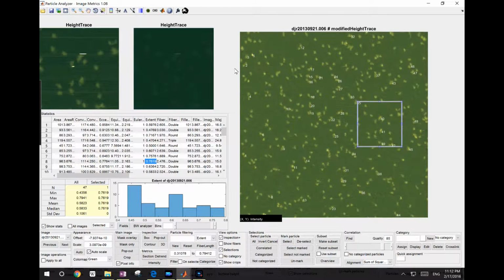Hi there. In this video, I will show you how to do particle filtering in Particle Analyzer. There are many ways to do particle filtering. The most obvious way is to use the particle filtering panel.